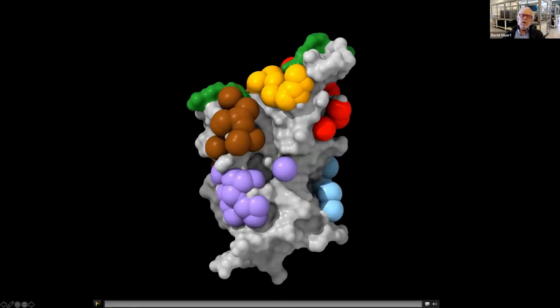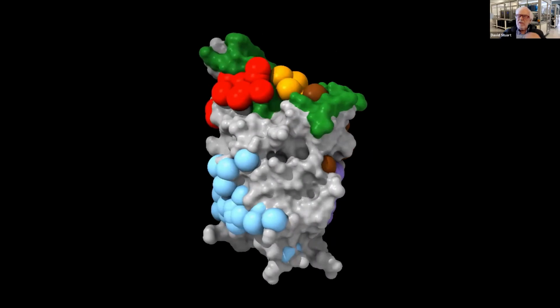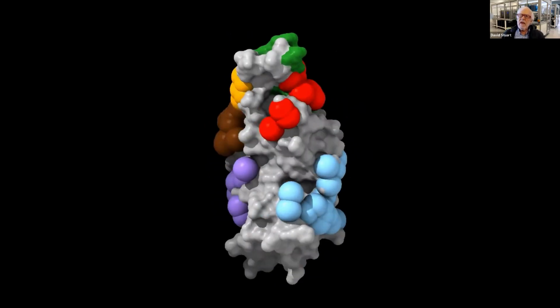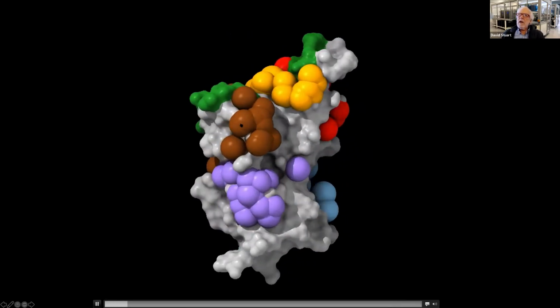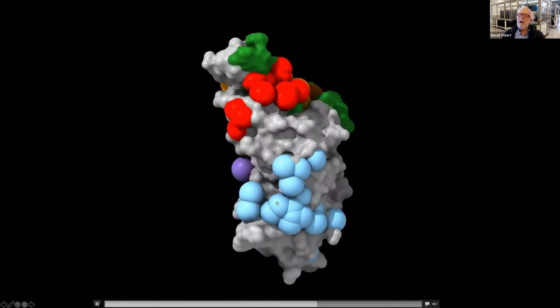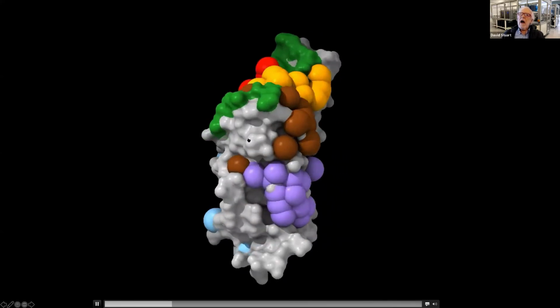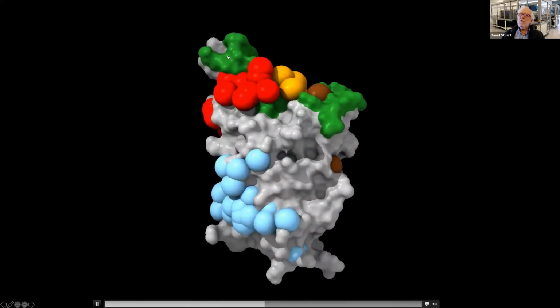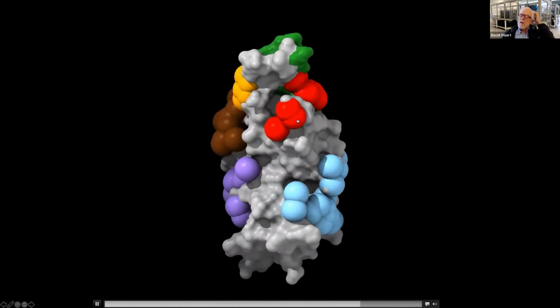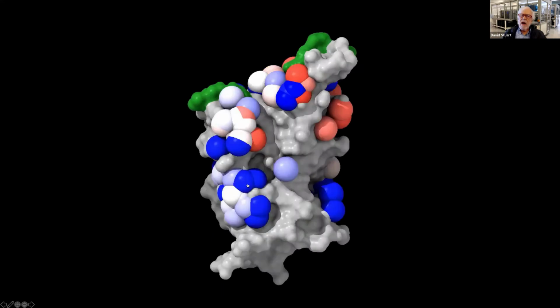This now shows the results of Helen's algorithm with Darming's data, and the clusters now are different colors. So the flanks are down here, the blue and the purple. The neck is up here, and then the shoulders, you can see that there. So we've got a complete mapping now of where all of these bind.